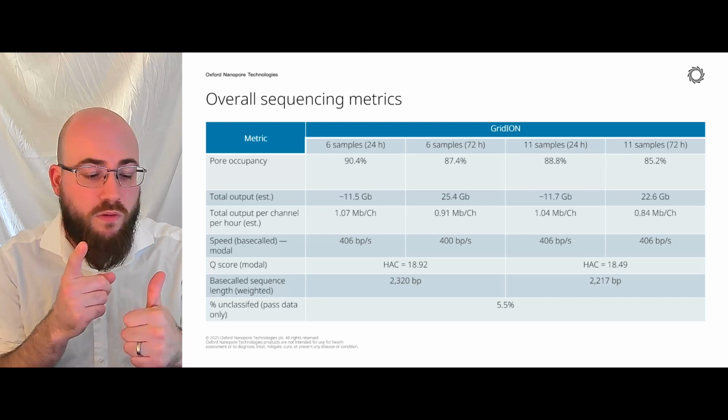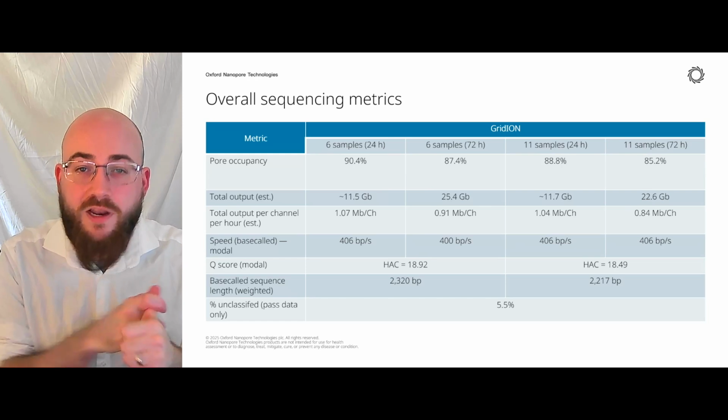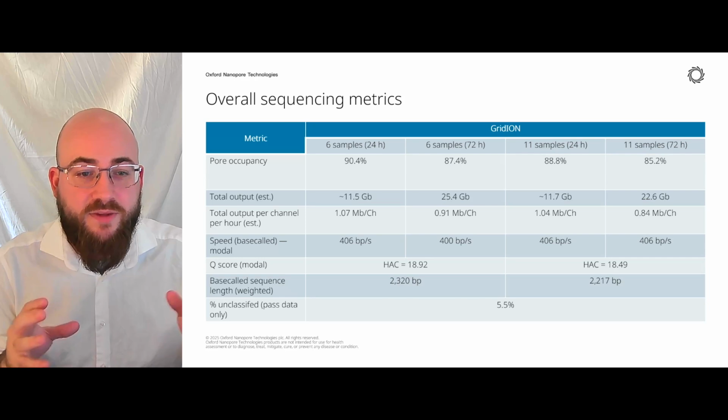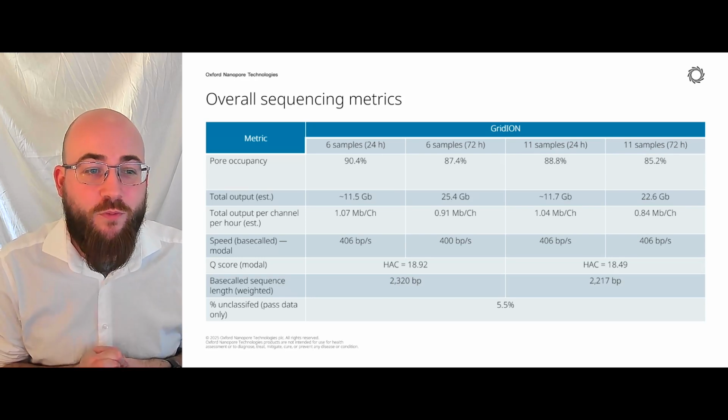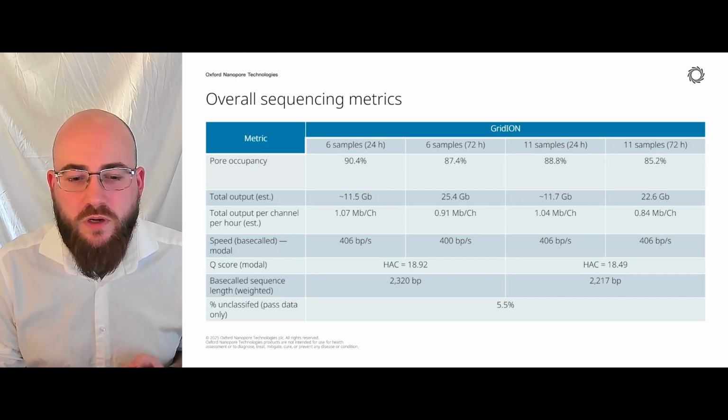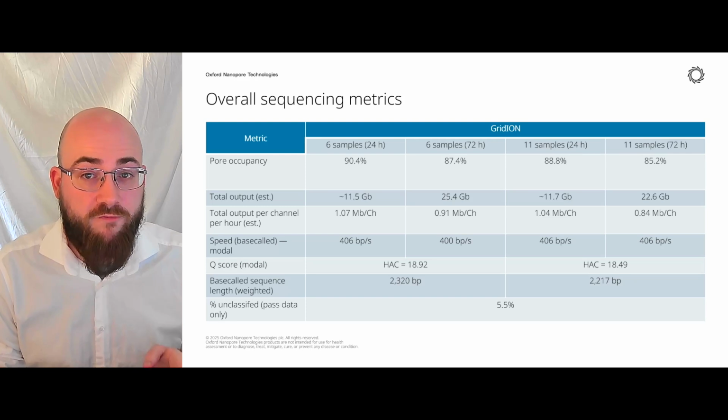So a gig on your viral and acellular arm, and a gig on your bacterial and fungal arm. And then we can see some other stats here. If you're really interested in looking at what they are, that's for you. So what do we want to talk about now? Well, I want to show you some of the testing we've done in terms of what we can find.